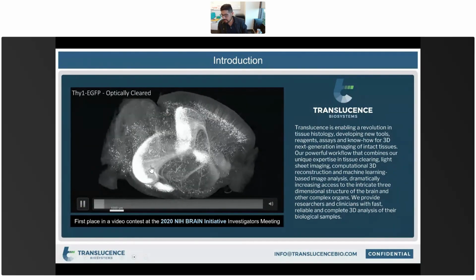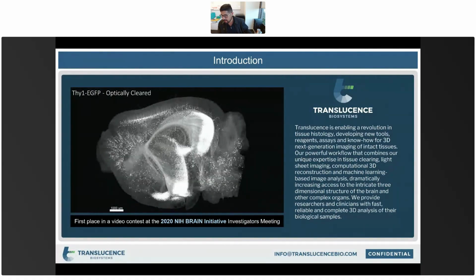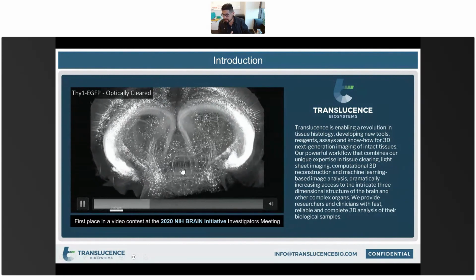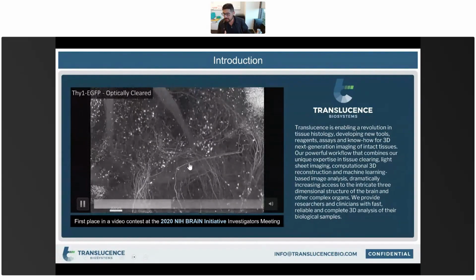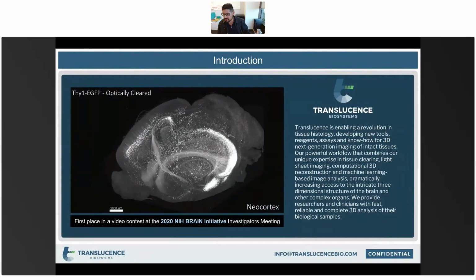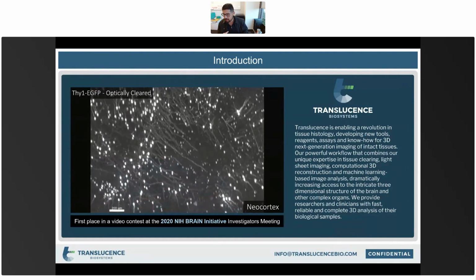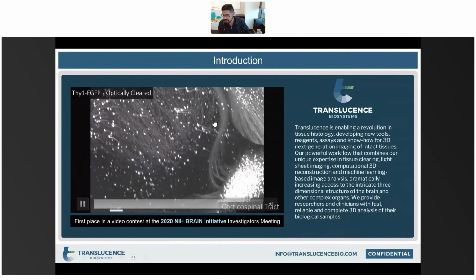like. In here, what we're showing is a cleared mouse brain stained with autofluorescence of GFP. And what you can see is that with 3D histology and light sheet microscopy, we can actually image the whole brain fully intact and span through it to see not only cell bodies, but also their projections, and also retain all of the anatomical positions of those cells.